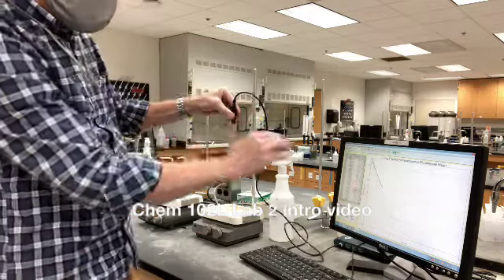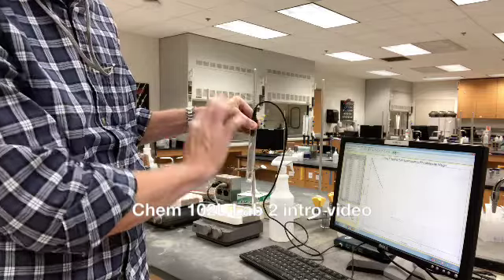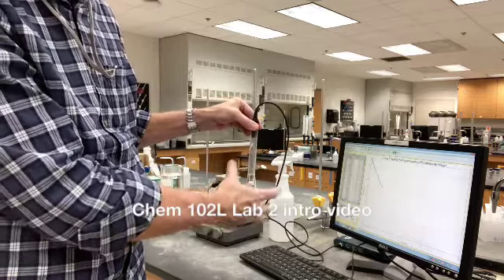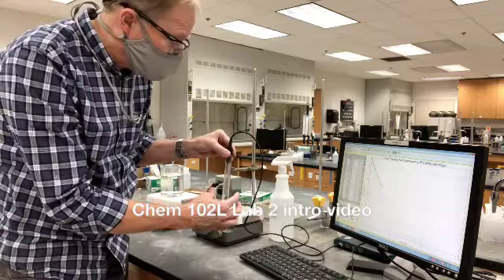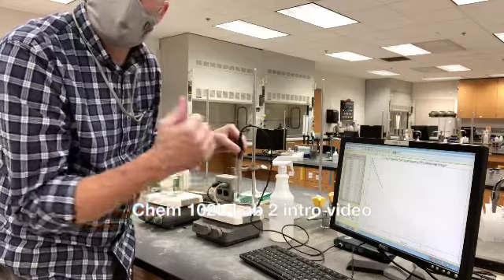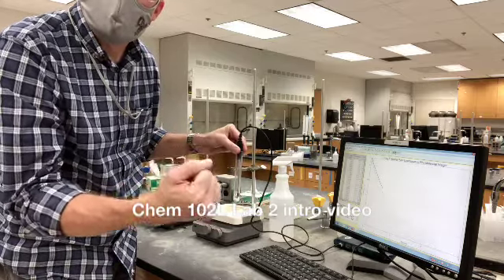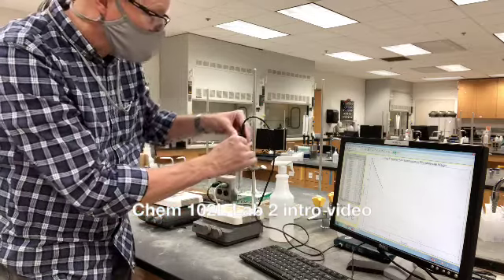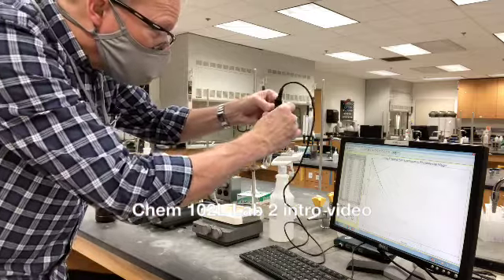But when we're done with that measurement, we are going to want to make now a solution. We're going to add a solute to this liquid of about 4 grams. And I want to show you how to use the mass balances to make the mixture. So we're going to add some of this unknown, and that's going to be the solute that dissolves in this liquid.